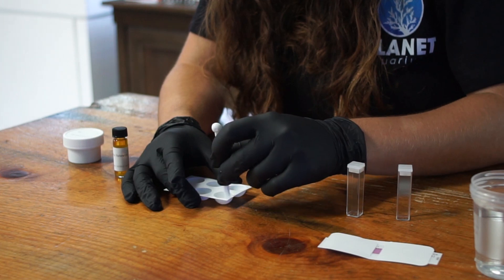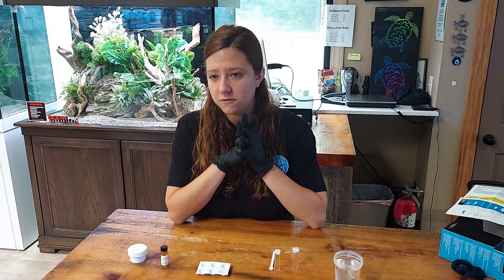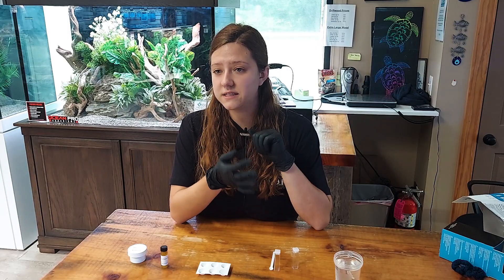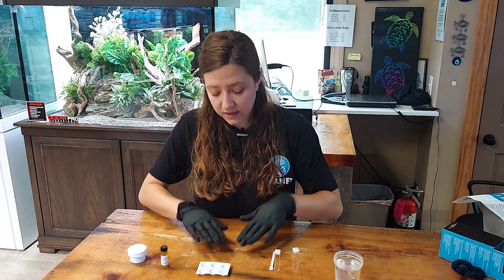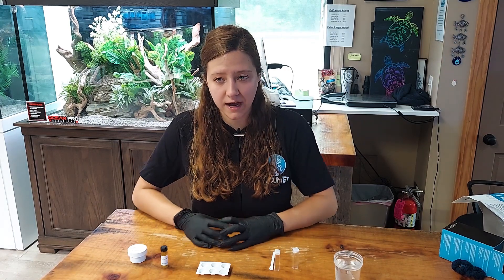Next you are going to stir that cavity with the straight end of the spoon. Then leave the cavity alone for about two to five minutes for the color to develop — except if you are using chelated iron, you are going to want to wait and let the color develop for a full 30 to 45 minutes. That is the first type of test that comes with the kit, which is for testing a normal range of iron.